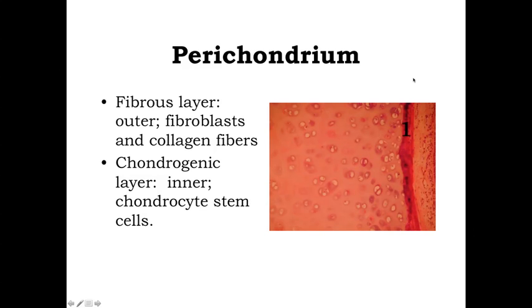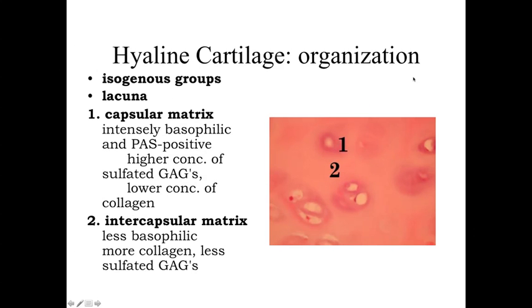mass of the cartilage. Now, if we look at the cartilage tissue itself, again, what we're going to be looking at, chondrocytes here kind of scattered around, extracellular material in between them, so type 2 collagen, abundant ground substance between it, giving a relatively smooth staining appearance. We're going to be looking at the fact that these cartilage cells, these chondrocytes, are going to be sitting within a space within the cartilage. Normally they're going to completely inflate and fill up the space.